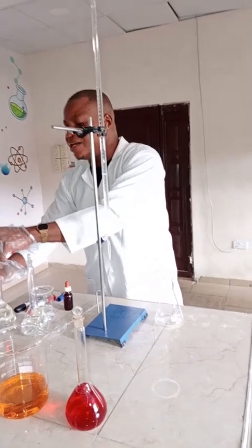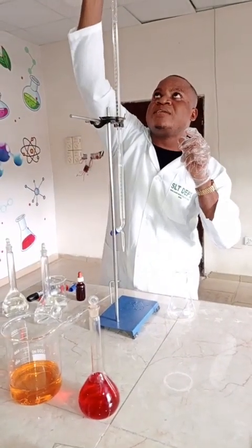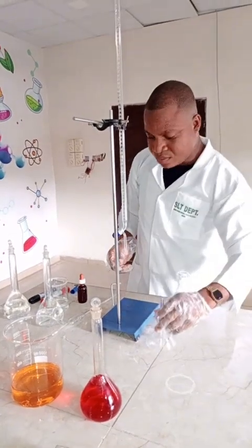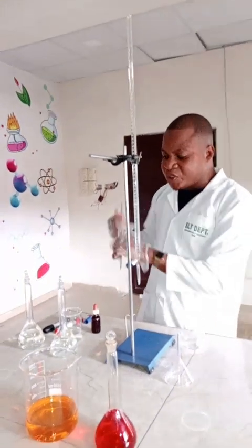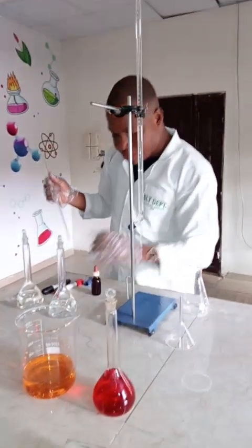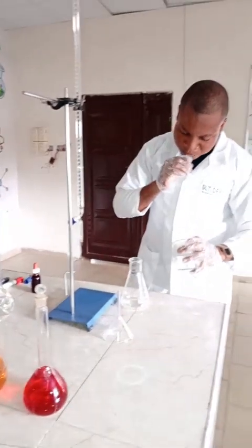Sorry, for the first I didn't take away the glass funnel. So I'm going to do that right away before titrating. Now I'm going to take another 25 portion of the base again. From this, I'm going to prepare another 25 ml of the base.